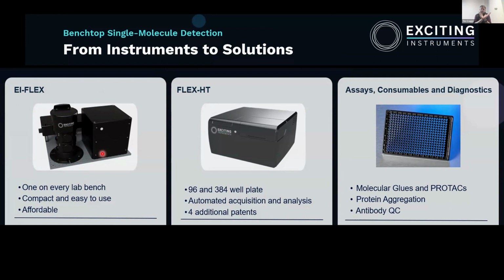This allows you to do things very much like what Kwang is going to talk about, where you've got static structures of the things you're interested in, maybe in different conformations, for example homodimers or heterodimers that exist in different shapes. You may well have the static information from crystallography, cryo-EM and other methods. But what's really important is: what are the actual conformations adopted in solution? How do they change upon interaction with substrates, ligands, cofactors, so nucleotides in the case of Kwang's work here? And then, how do they actually move?